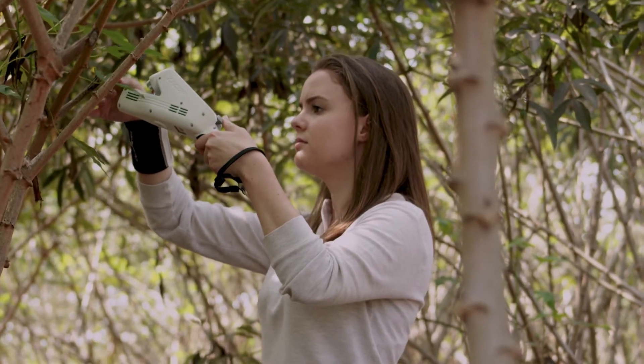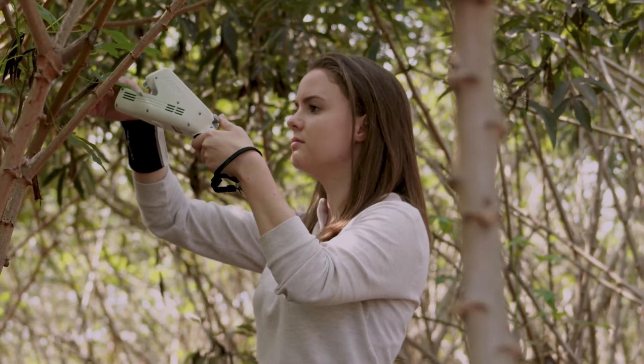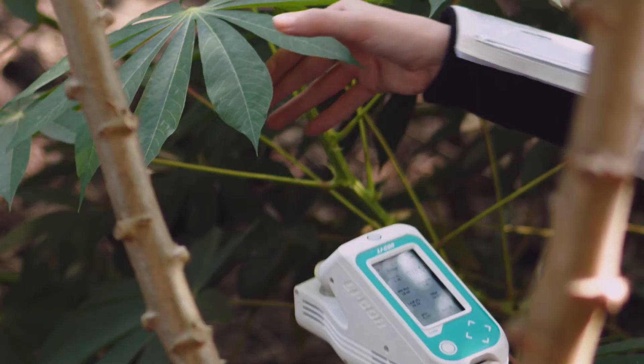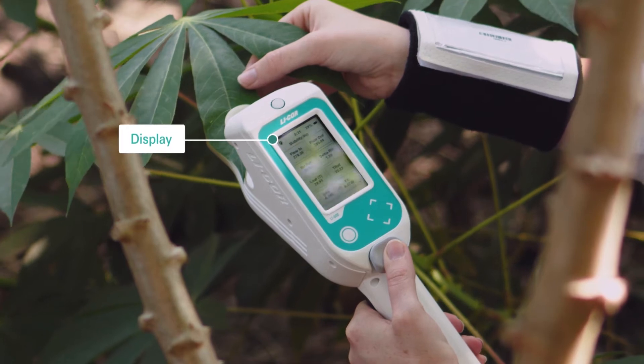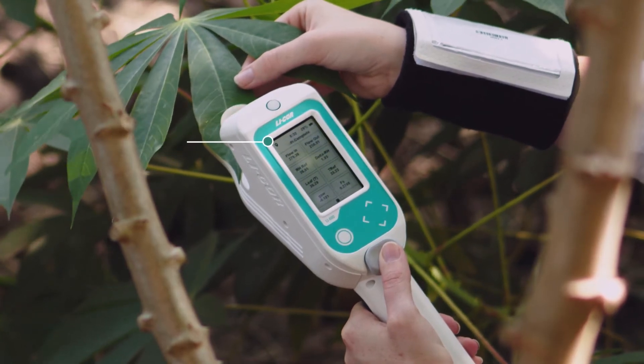Once you're on site, you can use the LI600 to take measurements as you move from plant to plant. Its software automatically determines when conditions are stable, and the LI600 logs each data point as you go.